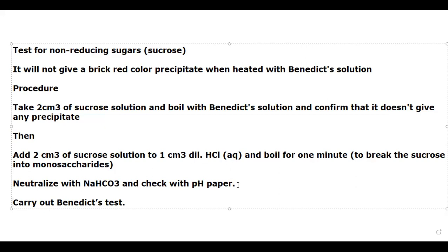What are you doing? Now HCl you have added, no? Yes or no? Yes, sir. Now that medium is acidic medium. In acidic medium, Benedict's test will not answer.